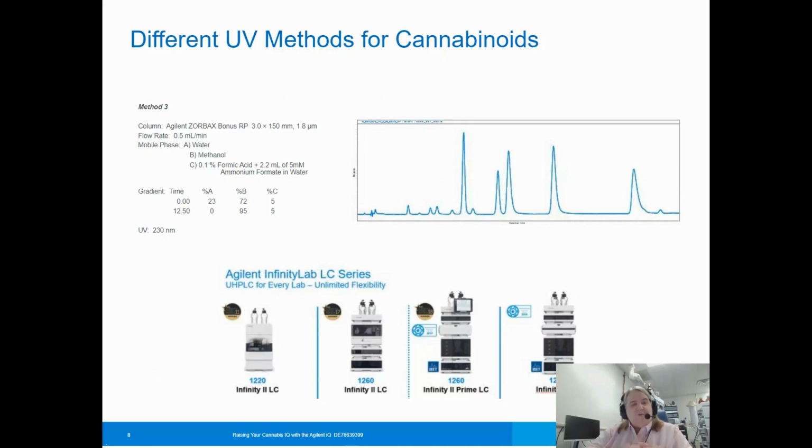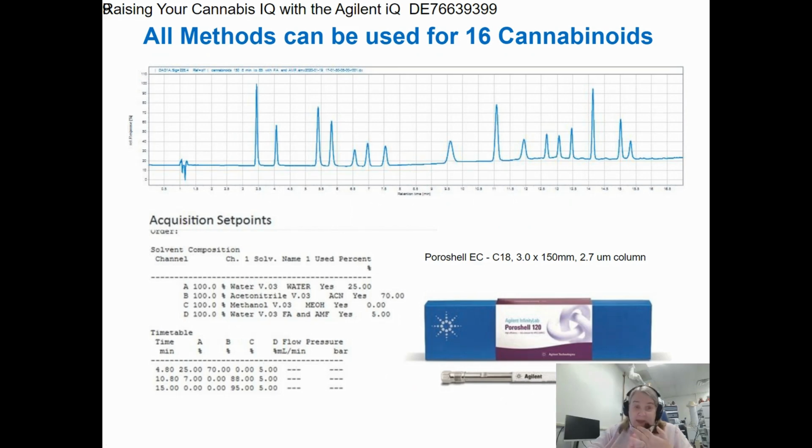Of course, I've got the Agilent ones that we're looking at. Most of the work that I've done has been on our Prime LC, which is a quaternary pump, because again, you'll find I'm the world's laziest chemist, so I really don't want to make up a series of mobile phases. You'll find that people are using ammonium formate and formic acid. These are both mass spec friendly, but they also add quite a bit of separation. Of course, I saved my method, which I'm really pleased with.